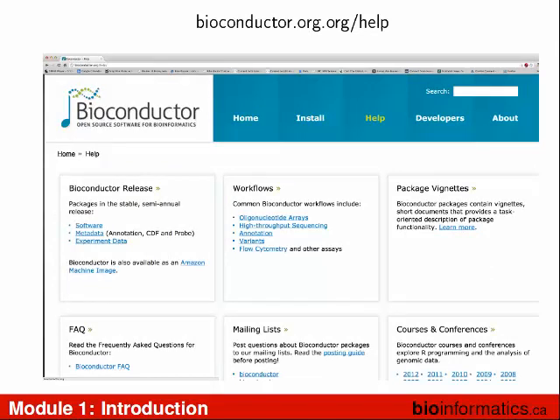And if you get stuck, there's help. So there's vignettes that describe all these tools. We have some example workflows for flow cytometry. So some of this stuff is a bit older. It's hard to know on the internet what's crap and what's not, right? Never try and get a diagnosis from the internet. And sometimes never try and get help on flow cytometry data analysis on the internet, because sometimes these workshops are better than others.